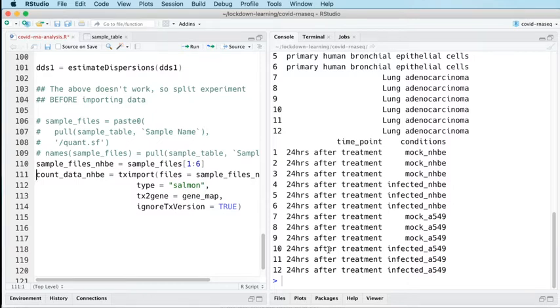So that will give us our 6 samples in from our count data. We then want to split our sample table. We want our sample, the first 6 rows of our sample table. So we're subsetting the sample table to give the first 6 lines of that.